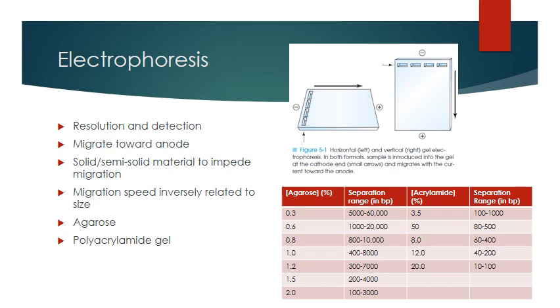Now you can use electrophoresis to also resolve or separate nucleic acids. And now DNA or nucleic acid is negatively charged. We know that. Under an electric current, DNA is going to migrate towards the positive pole, negative towards positive, the anode.